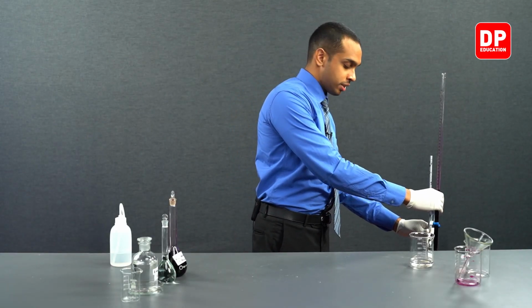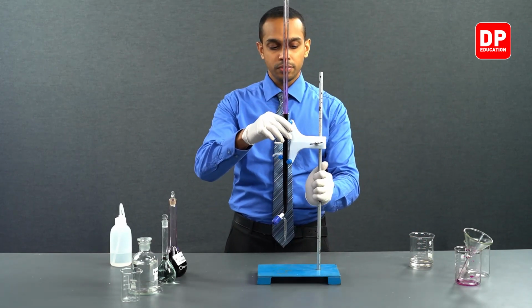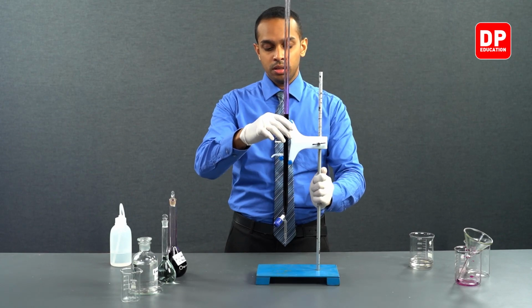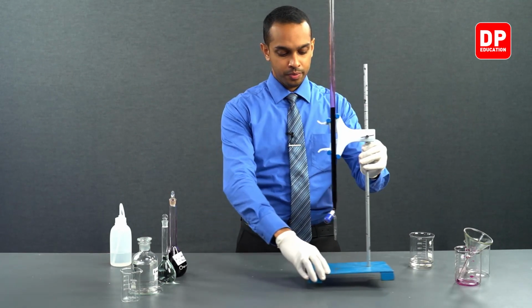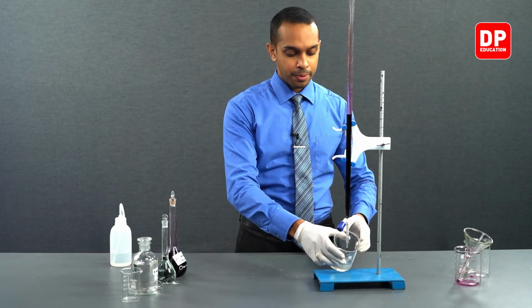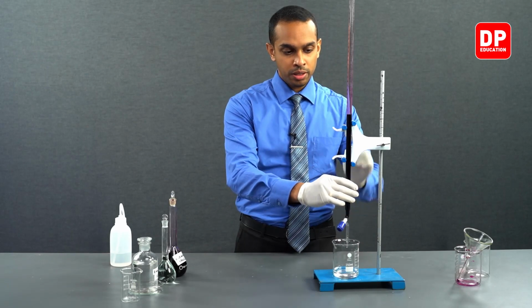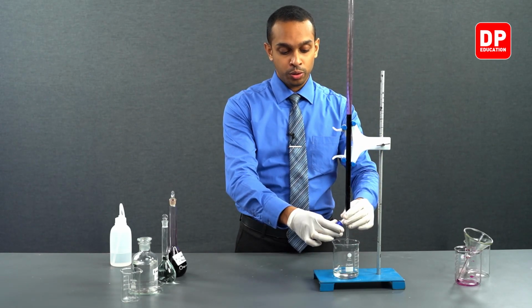Now I will move this back onto my table. Just like in the previous setup, I will open this tap and make sure that the tip of the burette is also fully cleaned.